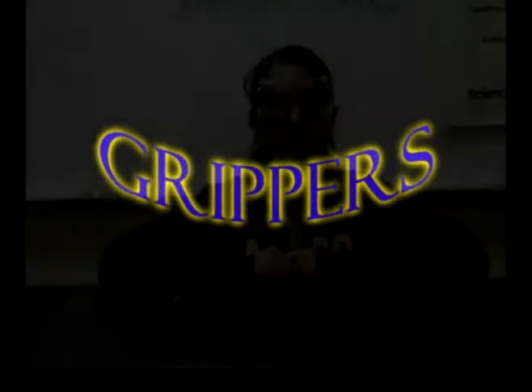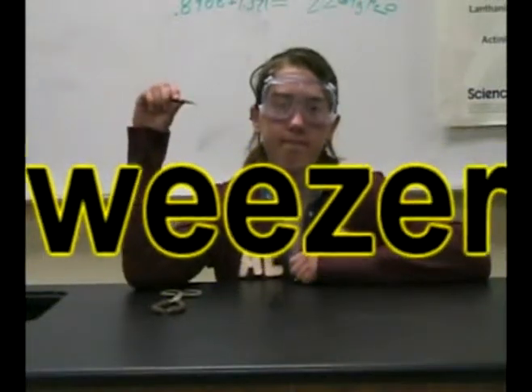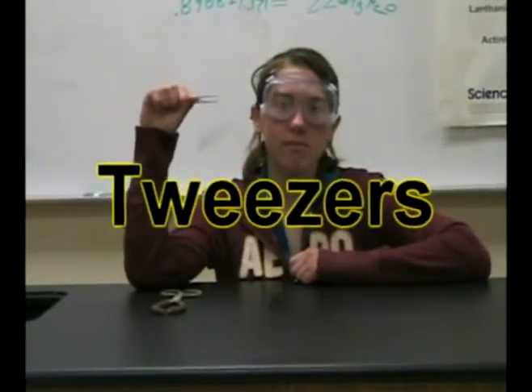Now, we're going to move on to grippers. Tweezers. Tweezers are used to grab little tiny things. They cannot grab big things.